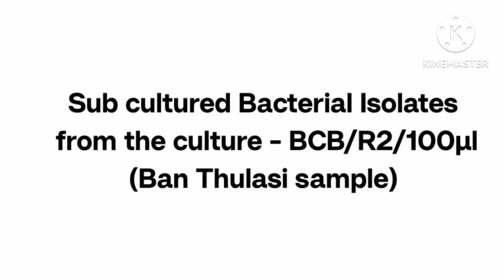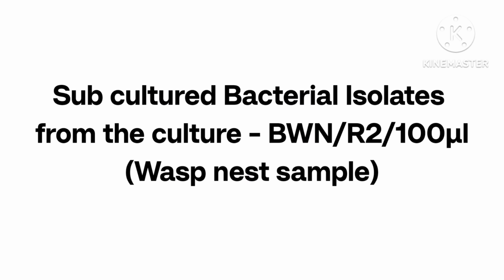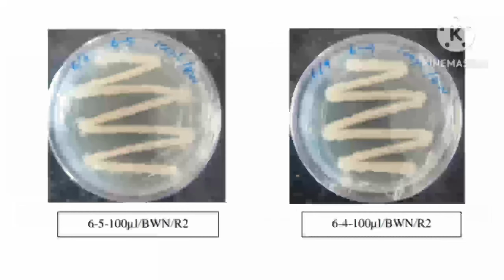Subcultured bacterial isolates from Bantholosi sample. Subcultured bacterial isolate from replication 2 under 100 microliter dilution. Subcultured bacterial isolates from wasp nest sample. Subcultured bacterial isolates from replication 2 under 100 microliter dilution.